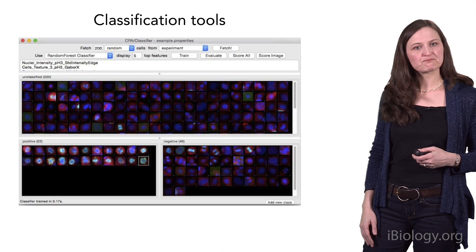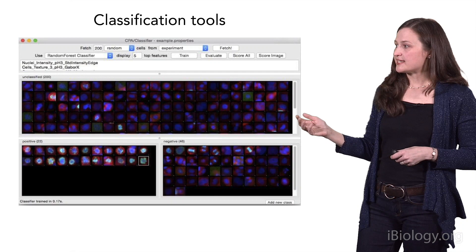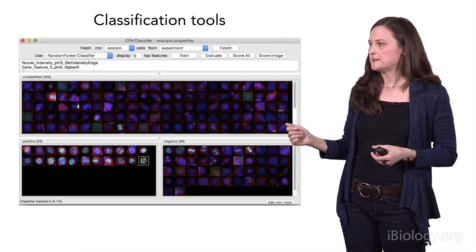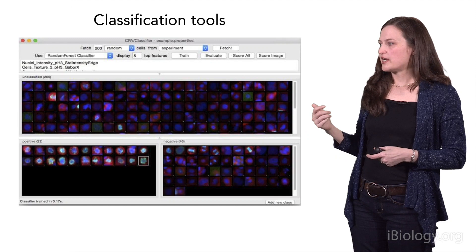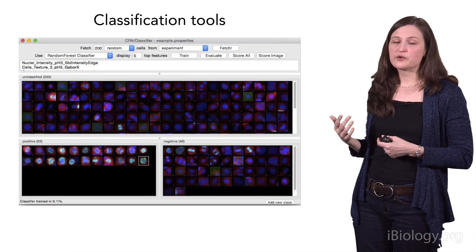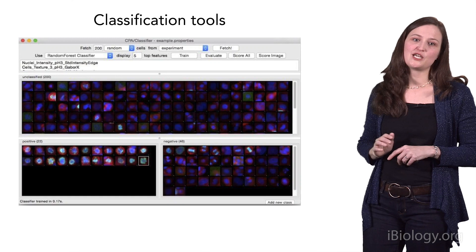The most popular feature of CellProfiler Analyst is its classifier. It displays cells or other objects from your experiment and asks you to sort them based on their phenotype of interest. You simply drag and drop individual cells to sort them as positive or negative for a phenotype — or into as many bins as you like. As you sort, the computer learns from you and identifies the metrics that distinguish the different bins. As you sort more cells and correct errors, the classifier gets better, to the point where it can correctly score millions or billions of cells in a completely automated fashion.